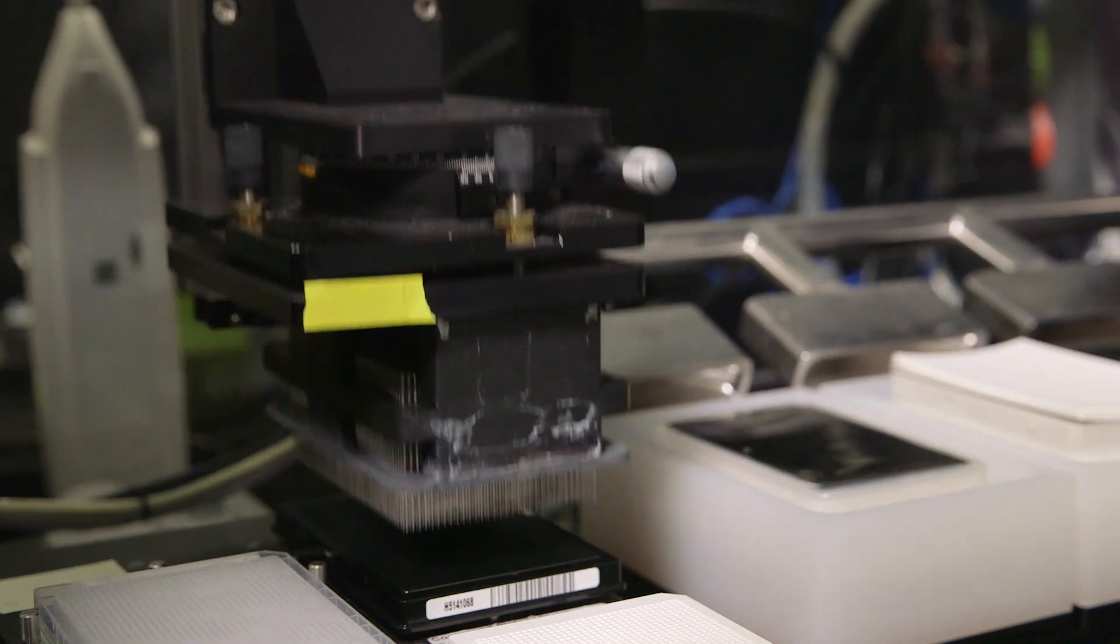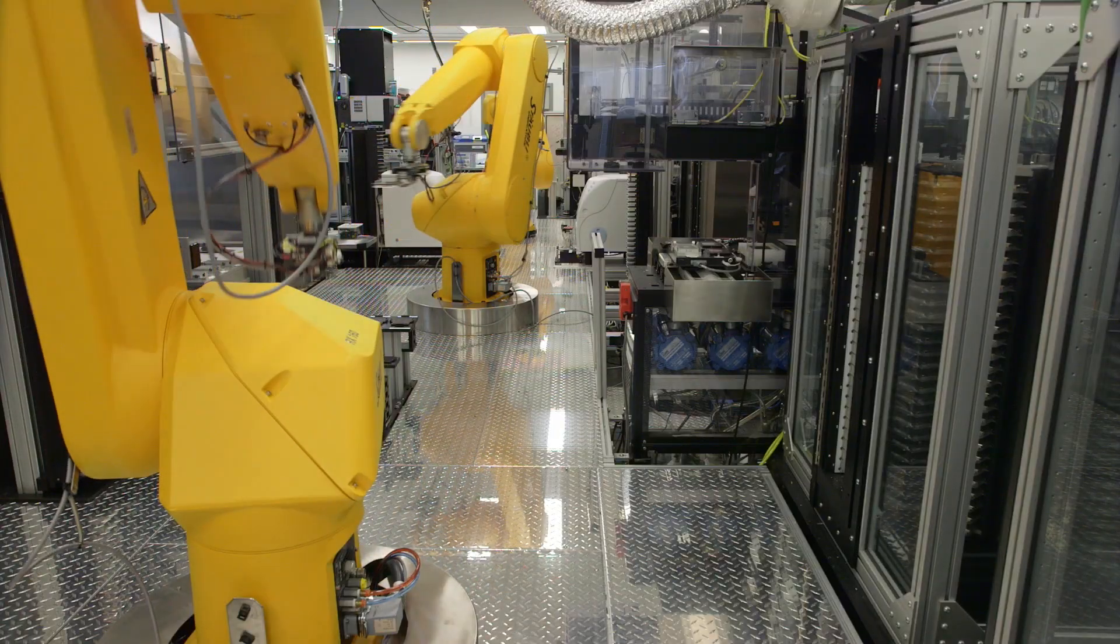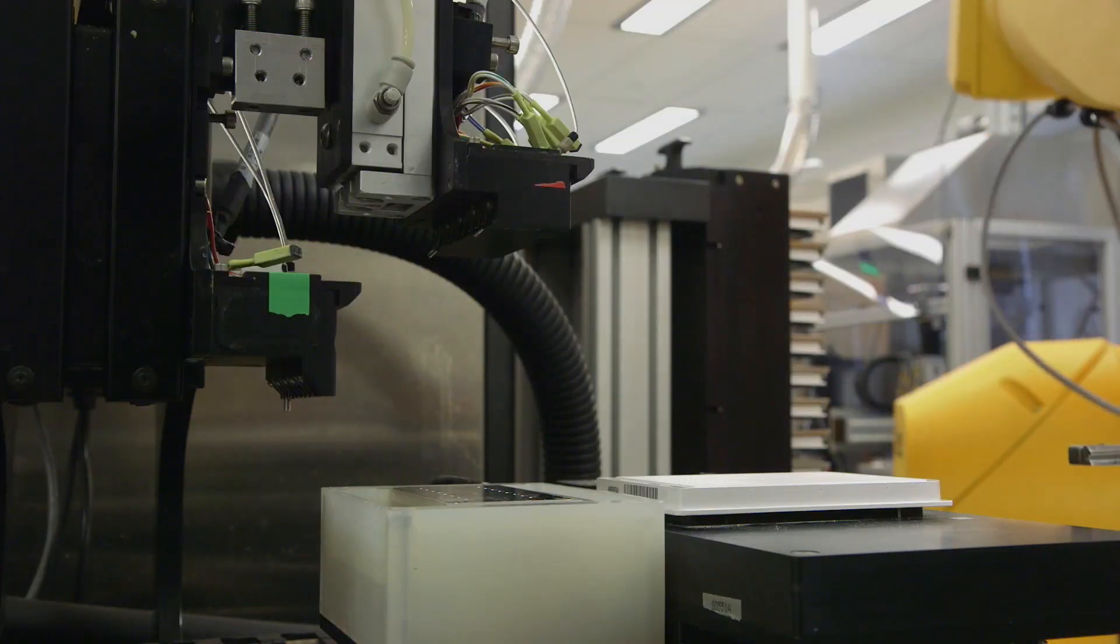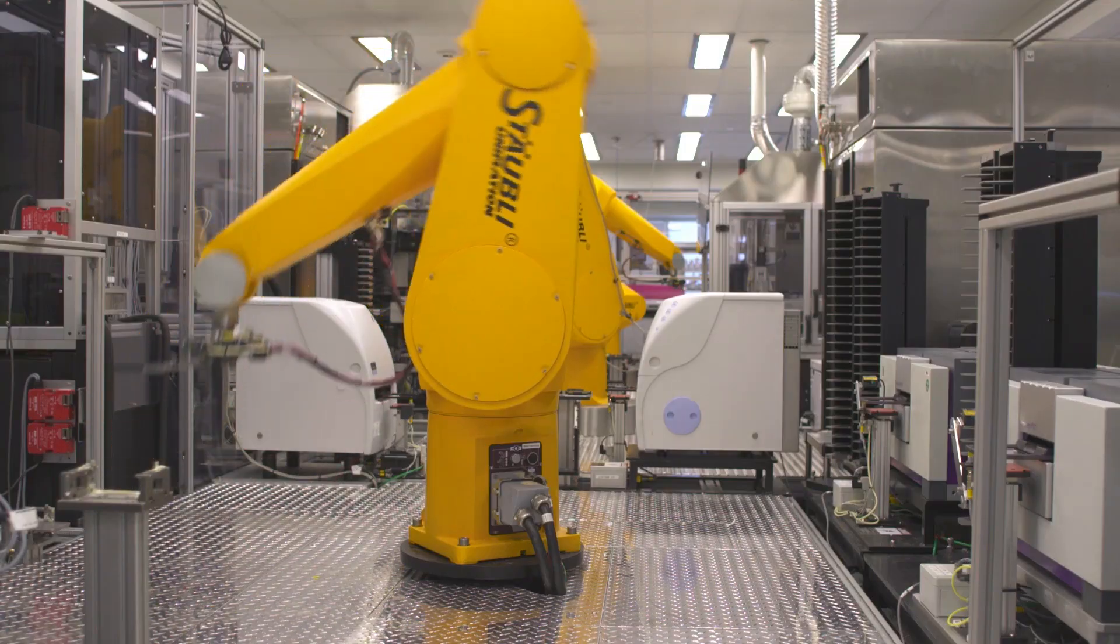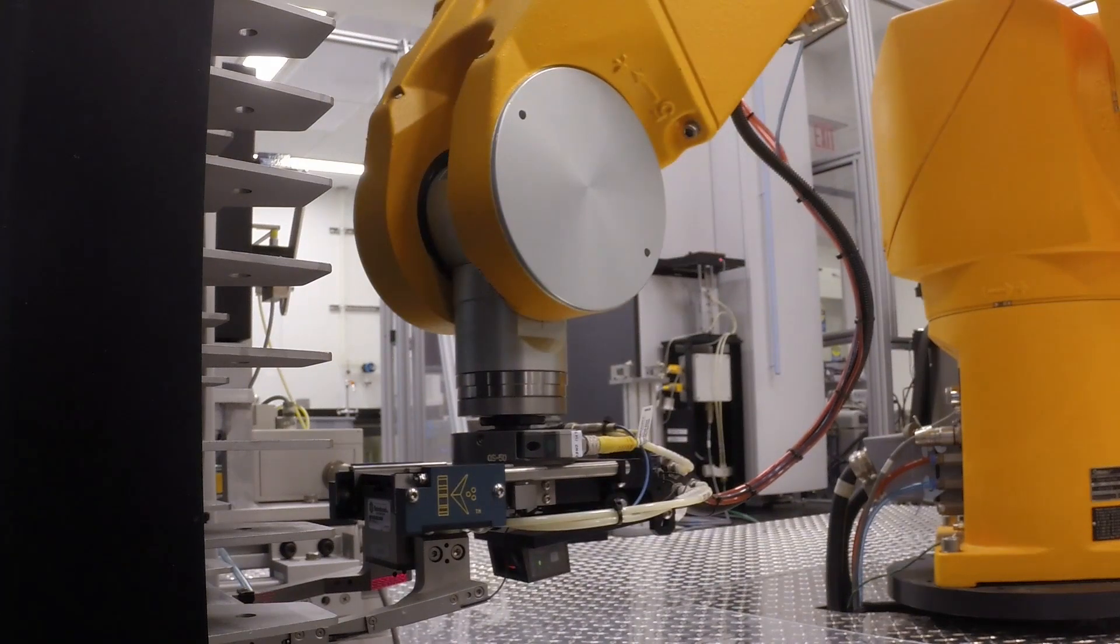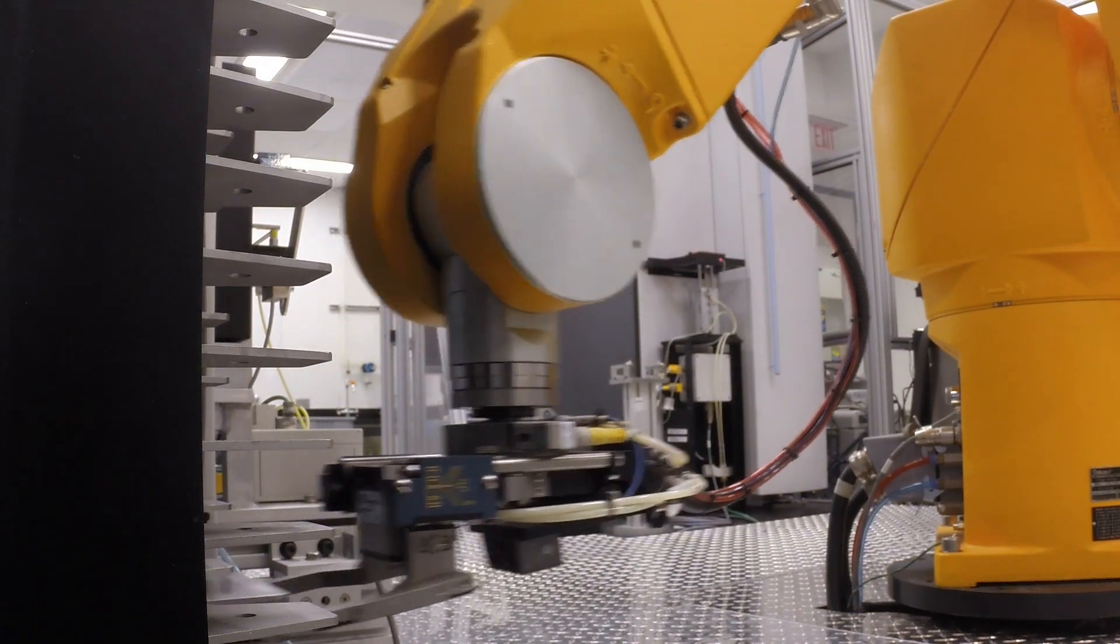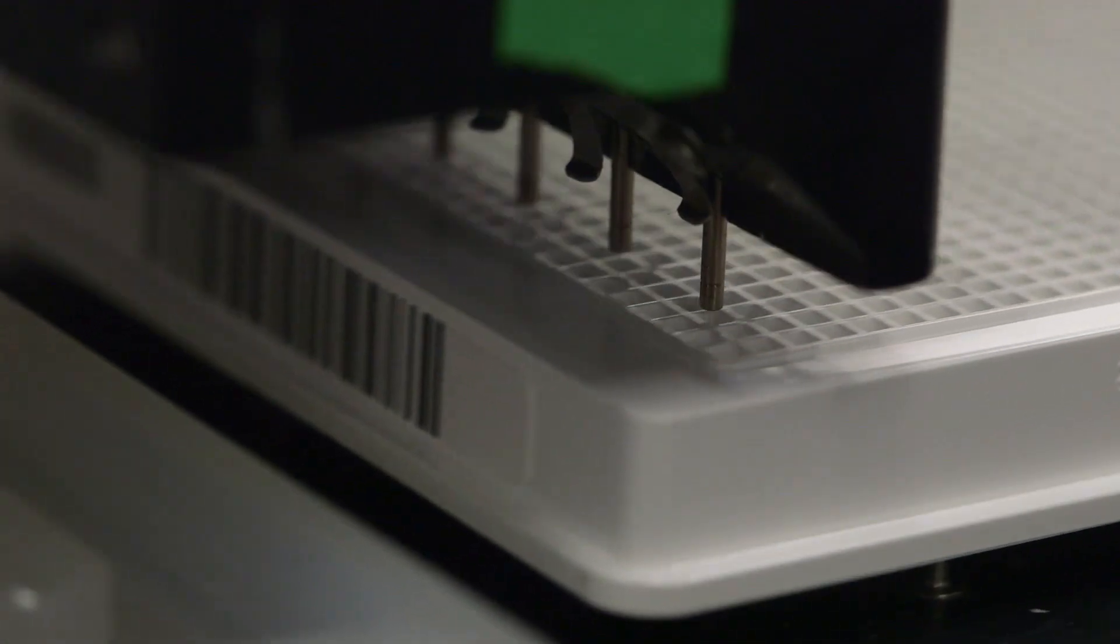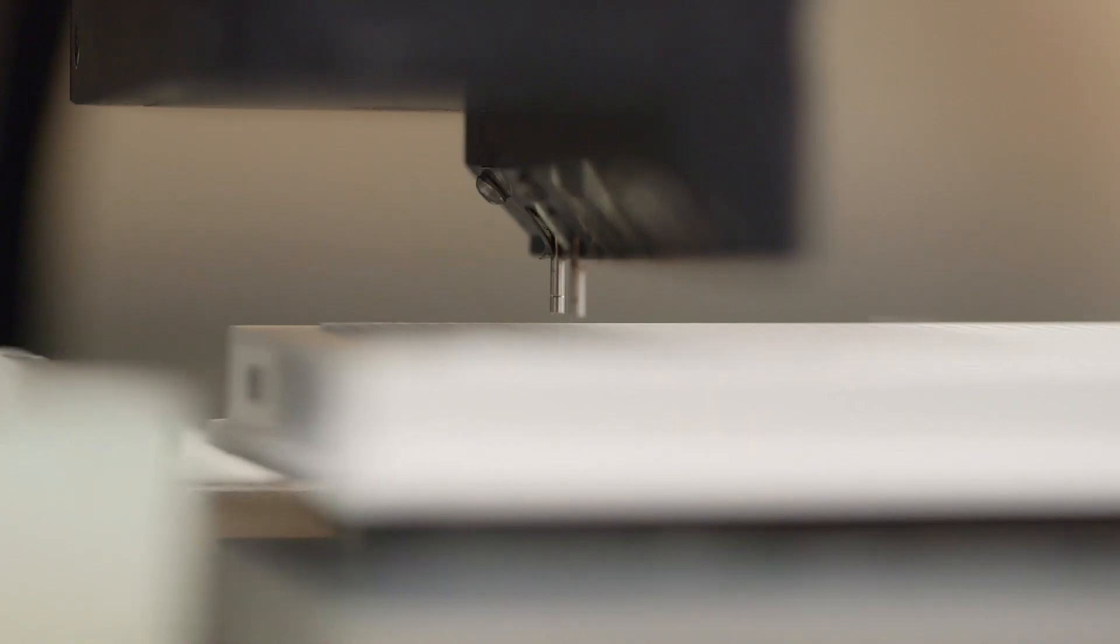NCATS preclinical researchers use a state-of-the-art, high-throughput robotic screening system to test hundreds of thousands of compounds that are potential drugs against disease-relevant assays. An assay is a test using cells or proteins involved in a particular disease or biological process the researchers want to study.